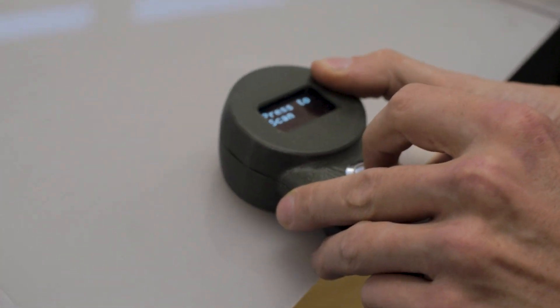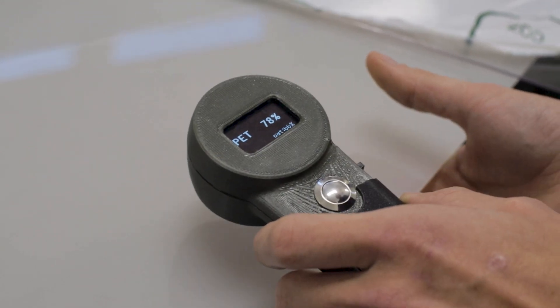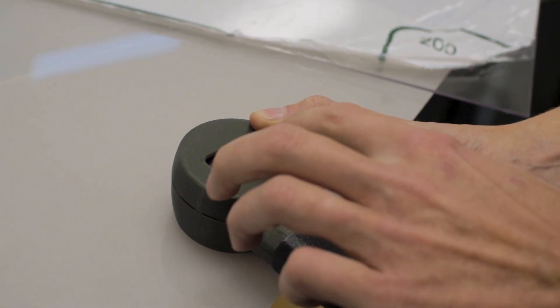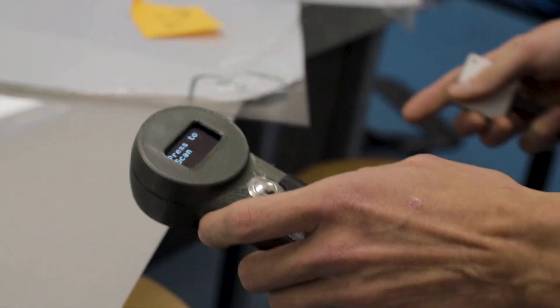Here we have another sheet which also looks like it's PET, and this also matches our expectations. Another reading which is a little bit more confident that it is actually PET.